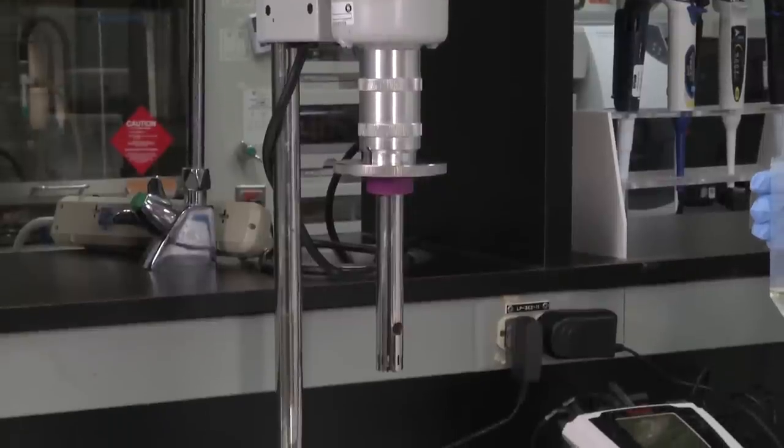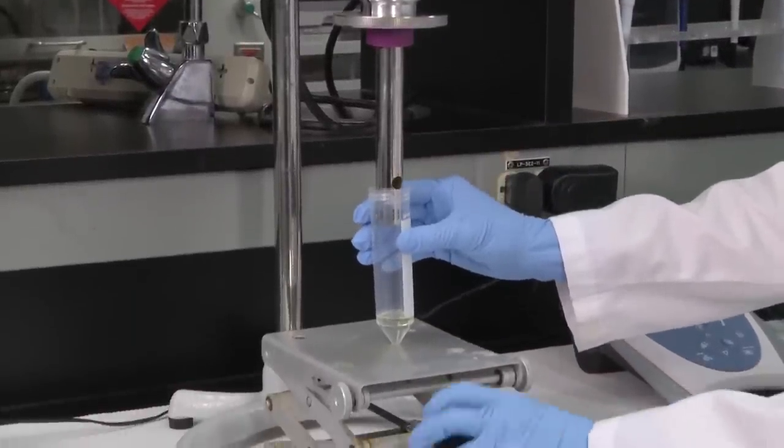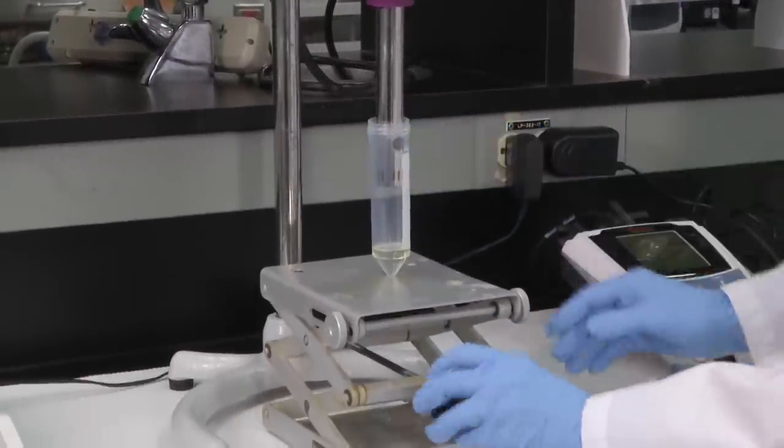Next, place the homogenizer probe into the tube so that the bottom of the probe blade is positioned at the oil-water interface.